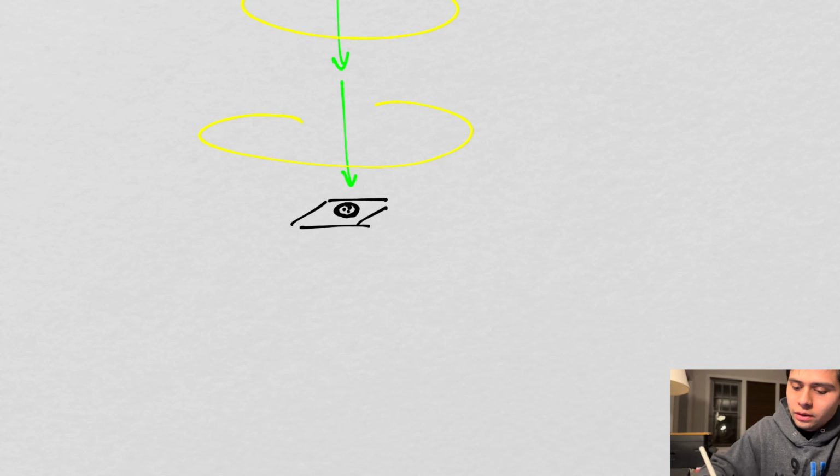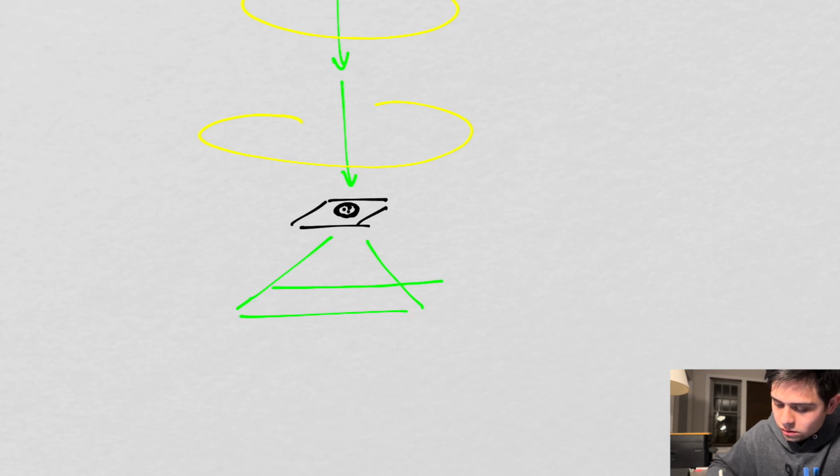Right? And when the electron comes in contact with your sample, it then produces a pattern, right?